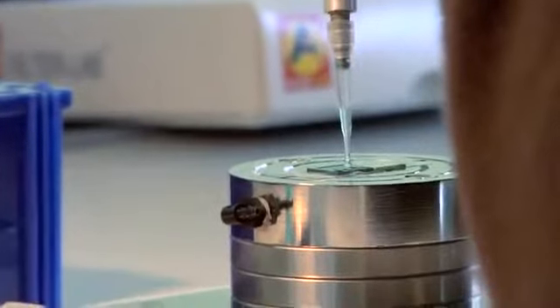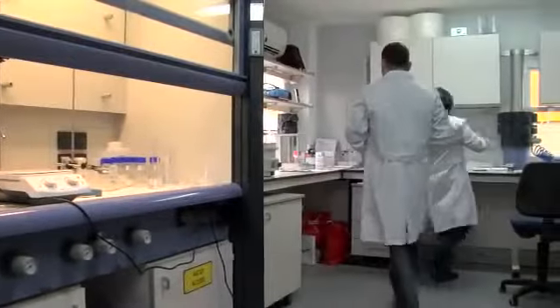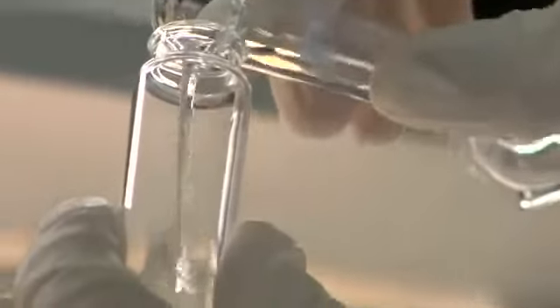What we really want to do is to try to deposit a droplet and control the conditions so that in each one of these droplets, this metal ion and the organic ligand react and form the crystal. Because of their small scale, it's historically been difficult to control the materials and conditions required to build these metal organic frameworks. It's hard to control the positioning of these precursors.